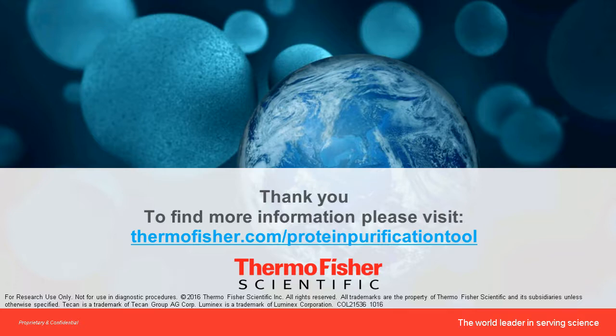Yeah. So at times you will see that the peptides in enriched IP-MS samples are present at very low abundance. And a lot of times, what we typically do is we have to go back and look at the data and make sure that we confirm the MS spectra, and with high confidence, we can include those peptides in our analysis.